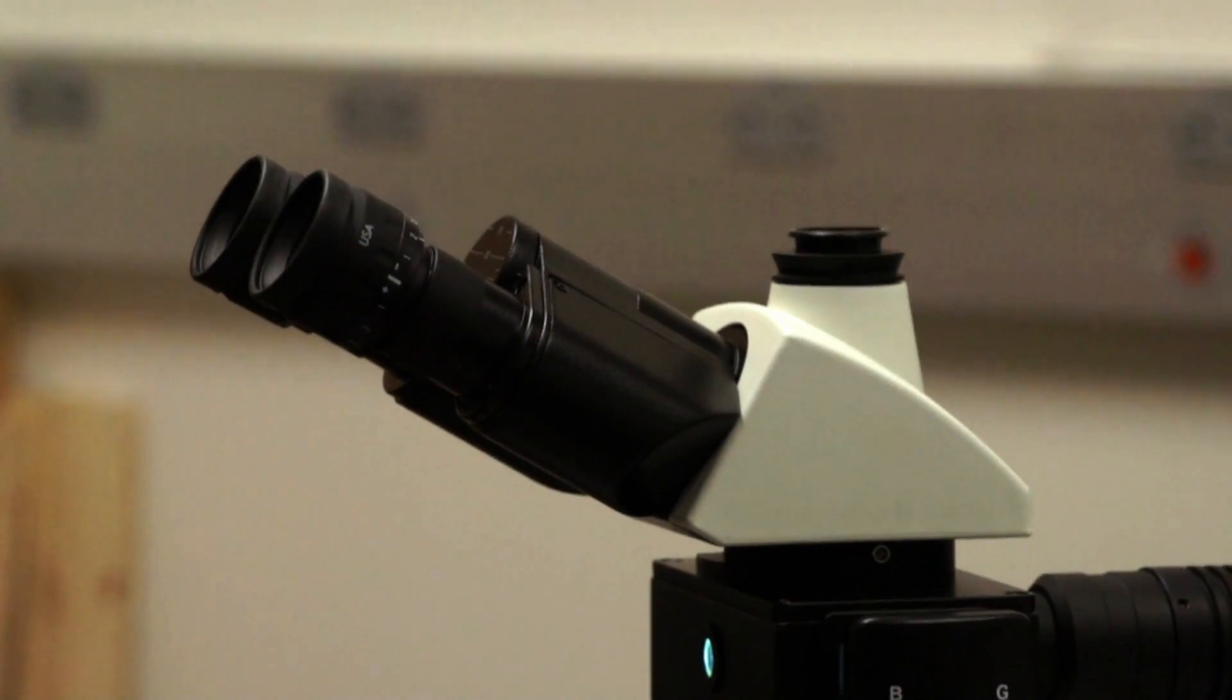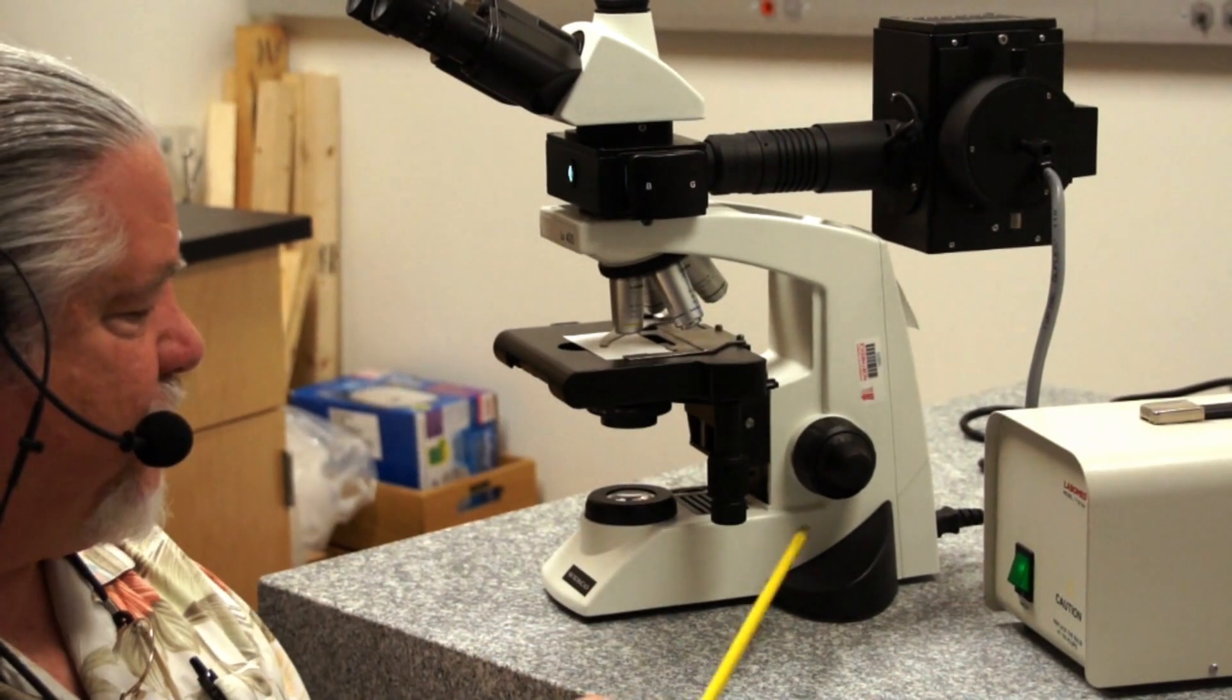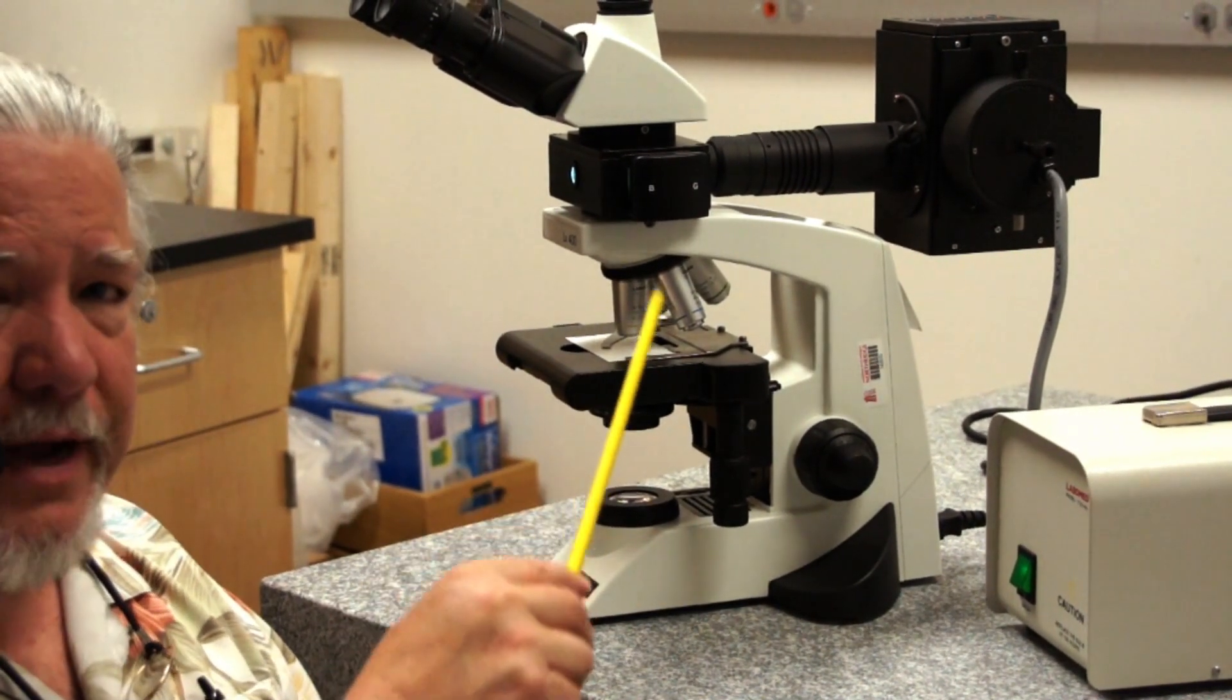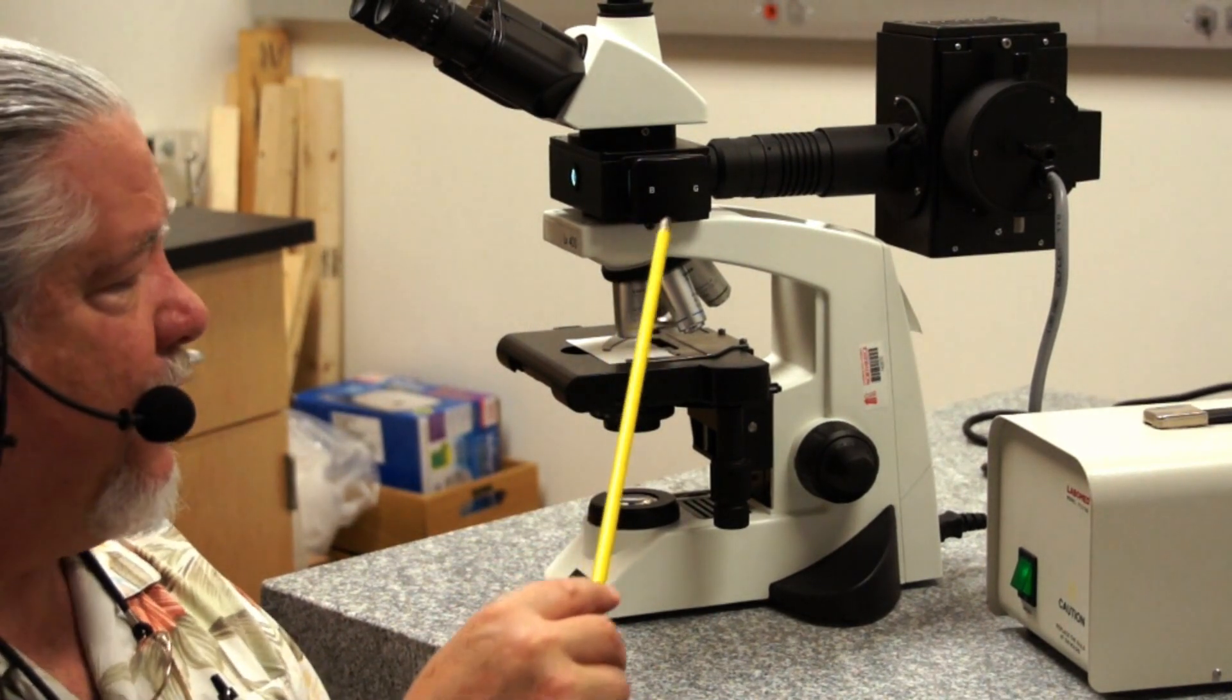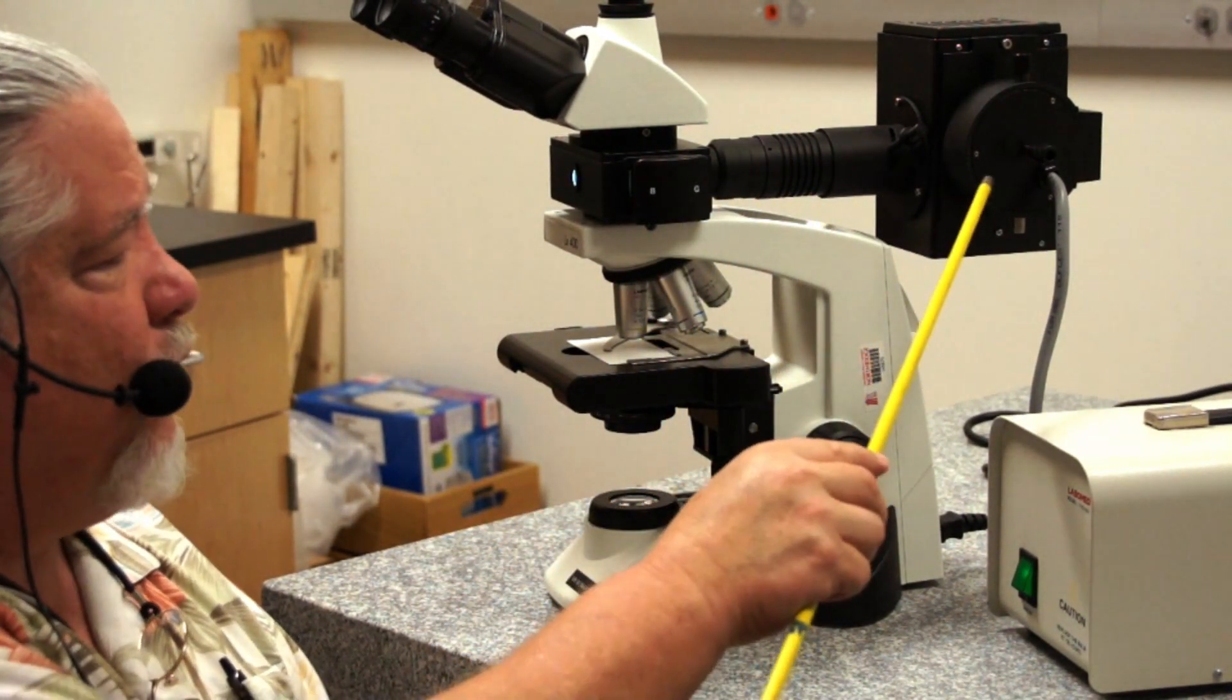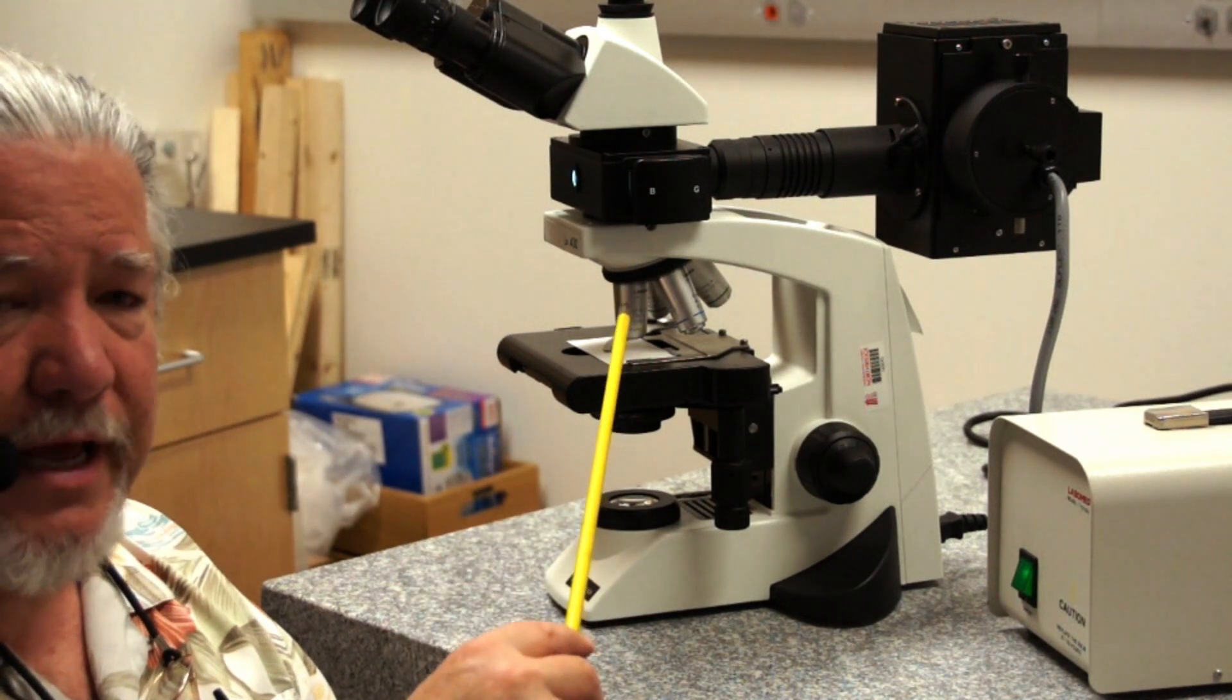We also want to discuss the illumination coming from above. We have transmitted light illumination through the microscope and we also have reflected light illumination. In fluorescence microscopy we use reflected light illumination.